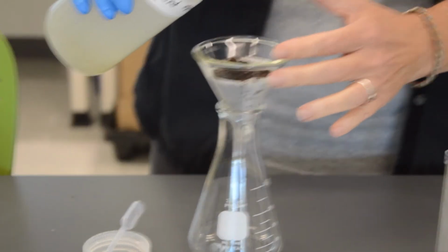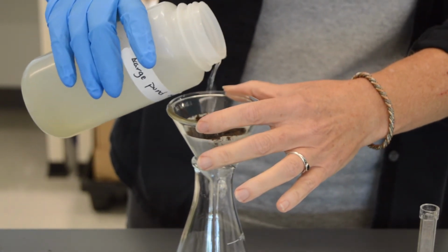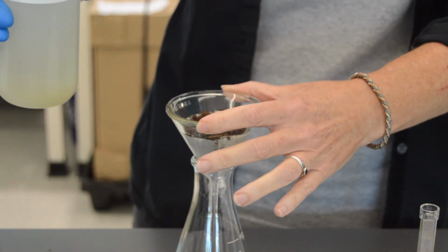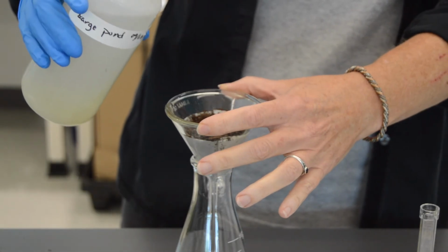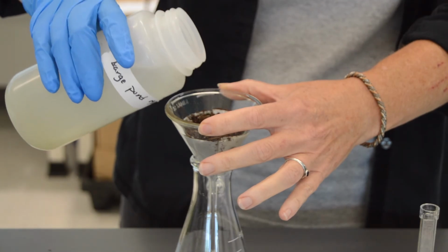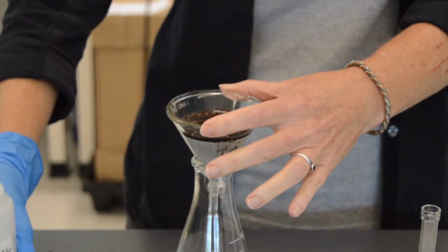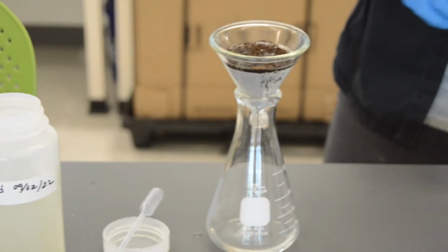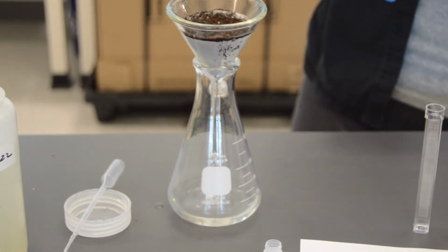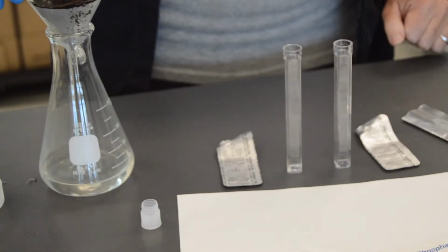See how. So I've just got potting soil and some filter paper. You can easily use coffee filters. They'll actually probably work better than this because this is draining pretty slow. Looks like I have a bit of potting soil in my water too. I just want to make sure we have enough to run the tests. All right, so we let our water run through.